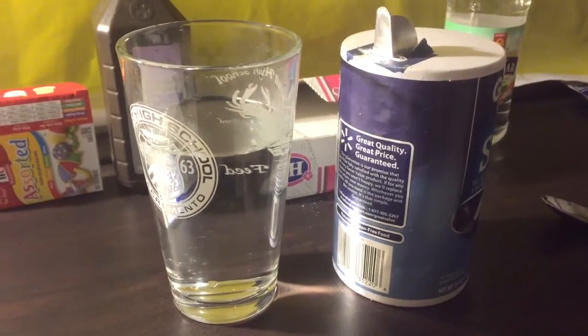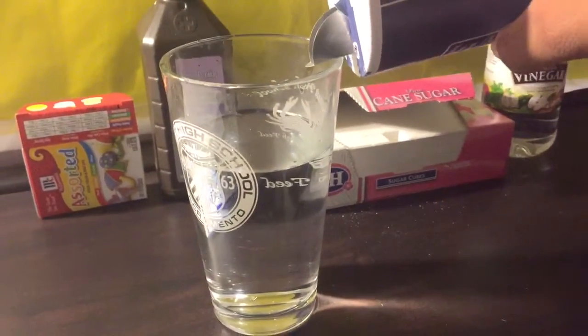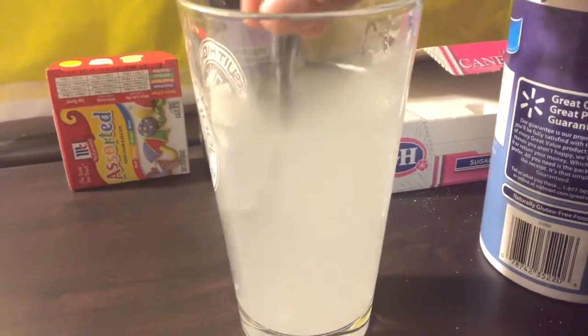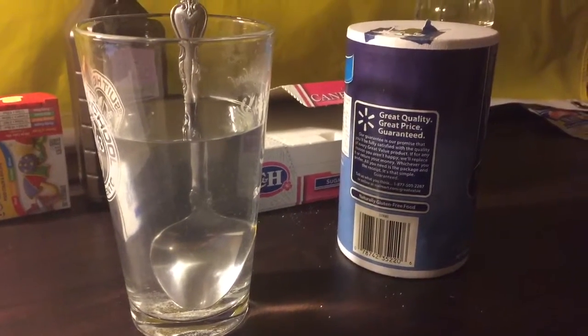So I have now removed the cold water and replaced it with hot water, and I'll be dissolving salt in there as well. So the salt in the hot water is completely dissolved now.